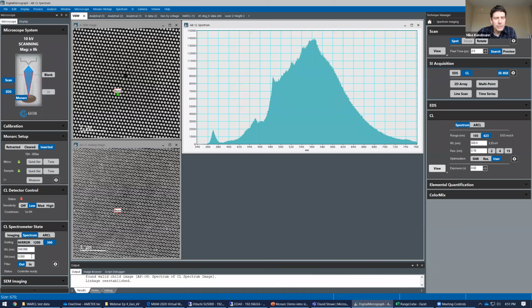If I can ask a quick question, just to make sure I understand how you're collecting these spectra. I assume you're scanning the light. You mentioned a slit, so you're scanning the light across the slit and then measuring the intensity as a function of the offset of the spectrum. Is that what you're doing? It's not a parallel detection, I guess. You're not capturing all the energy channels all at once. It is, right. This is not serial in any way. Oh, okay. So then why is there a slit? I guess I don't understand why there's a slit.